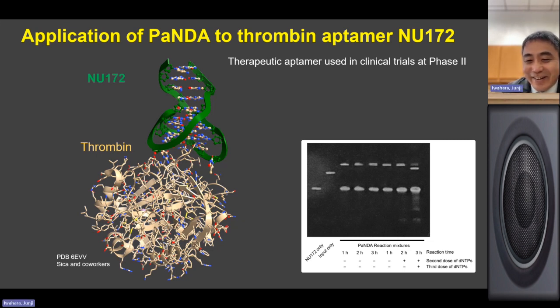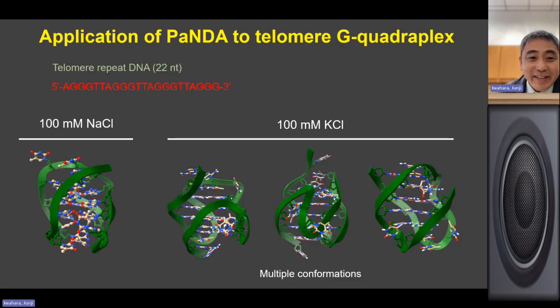Yeah, actually, you can change the dNTP concentration, and in fact, for telomere DNA, there is no C here. This is a telomere DNA, but we still used dCTP, and that is just a waste of the materials. And probably by using an optimized ratio of dNTPs, we can get better yield.